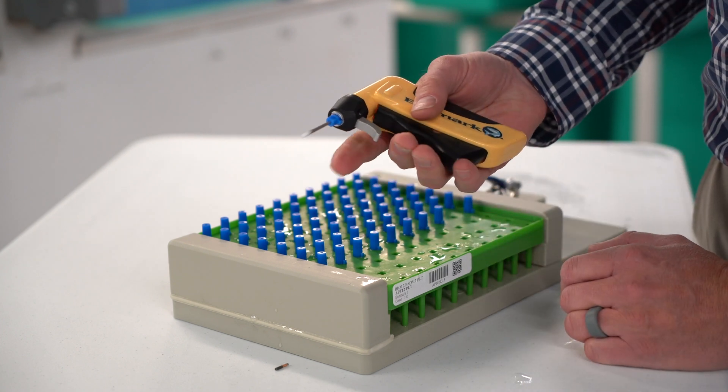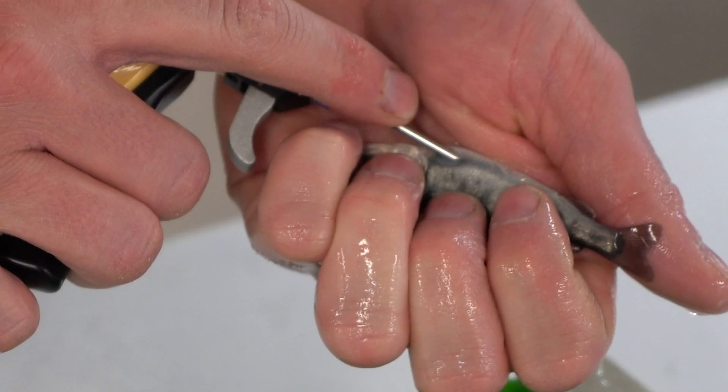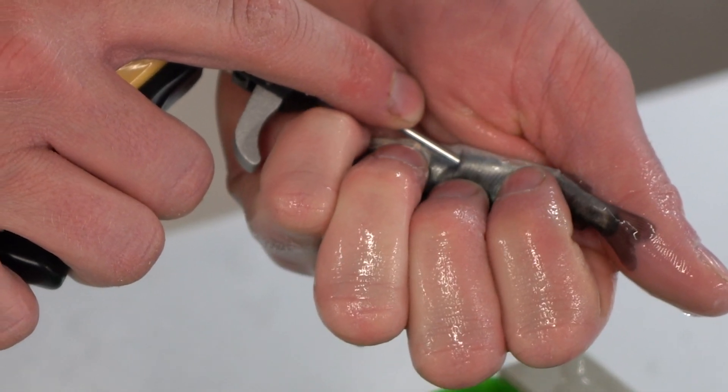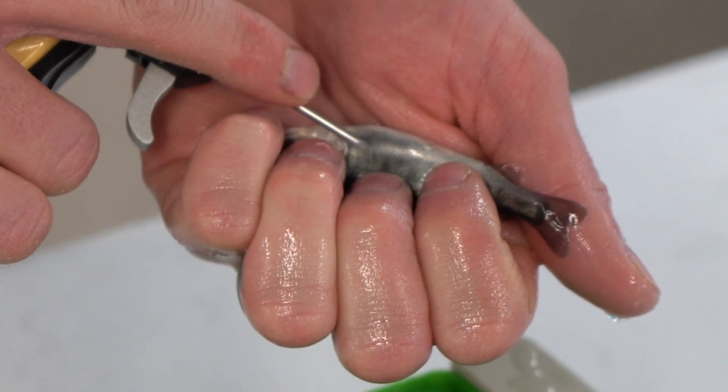Once the tag is injected, use the index finger to depress the silver trigger, ejecting the needle. Note the placement of the index finger on the needle. This helps stabilize the implanter while tagging and prevents the silver ejection trigger from being depressed during tagging.